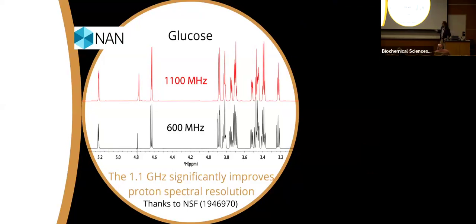So the take-home message that I want to highlight in terms of the 1.1 gigahertz, at least from the solution side: there are different strengths and weaknesses on the solid side, but on the solution side, the proton sensitivity is nothing great, but it's not bad, but it's not the thing that we're most pleased with. The spectral resolution is really what we are extremely excited about.